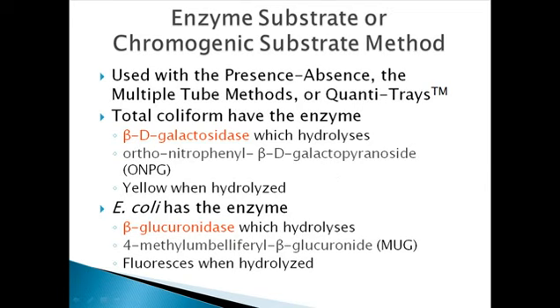Via those reactions we talked about, we use Durham's tubes. We have the test tube, we add liquid broth, and in this liquid broth we add a Durham's tube, which is a simple small tube, and we put it in the opposite orientation, inverted. After putting it there, the organisms can ferment the lactose, producing lactic acid and carbon dioxide.